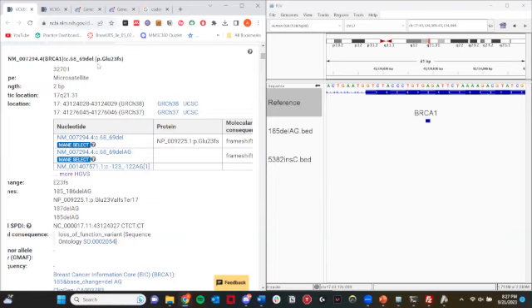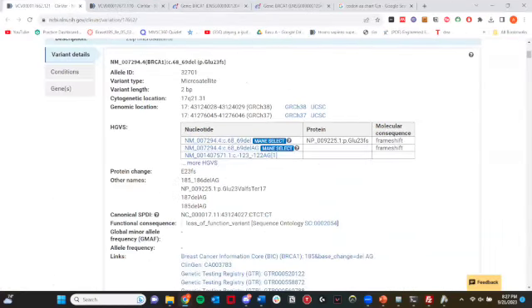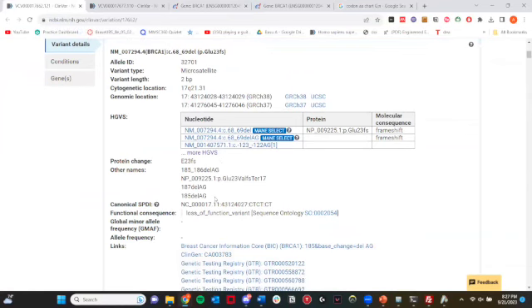So, can you actually show the other names? Here, this one. Oh, okay. Yeah, can you? So this name, according to 23andMe's annotation, this is the 186th position in one of their isoforms.